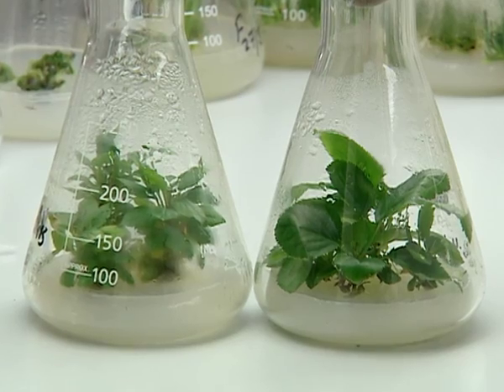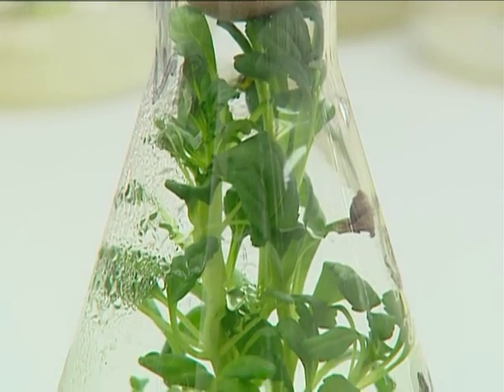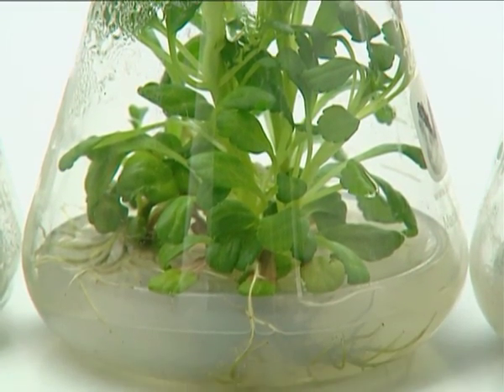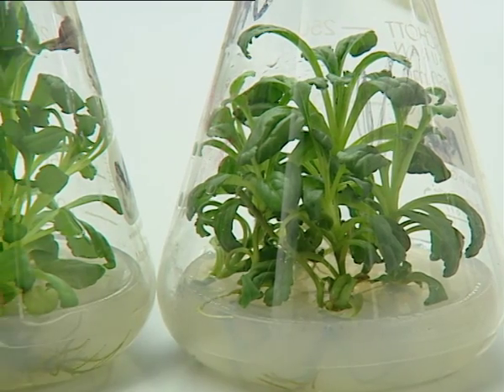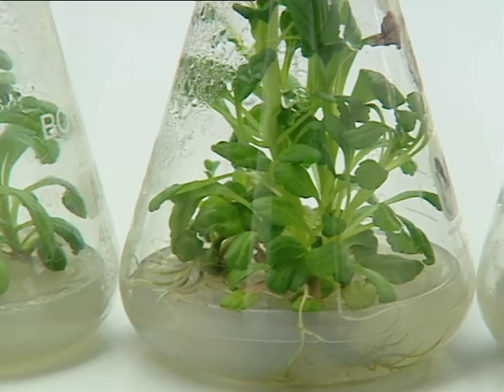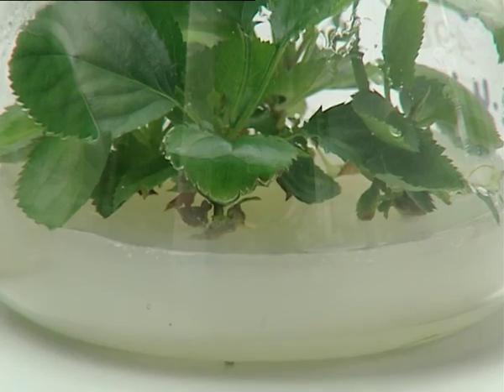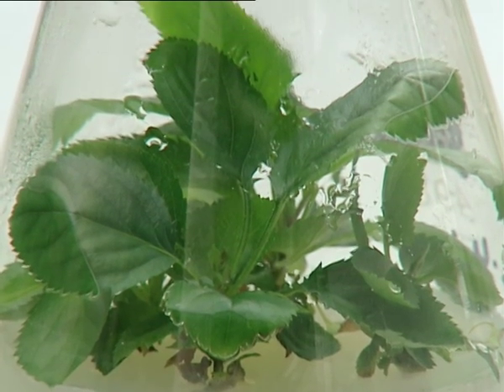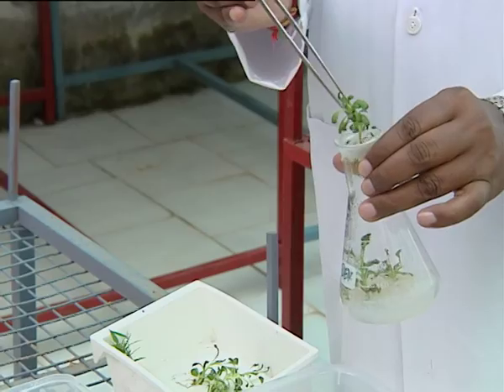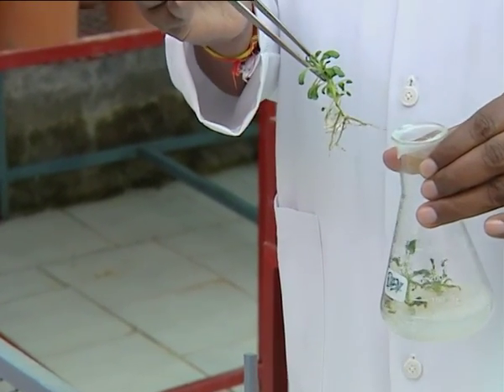Once the shoots have grown to an appreciable height of about 3 to 4 centimeters, they are rooted. Generally, auxins are used in the culture medium to induce rooting in each of these shoots. Once the shoots are rooted, these have to be hardened for acclimatization in the open.